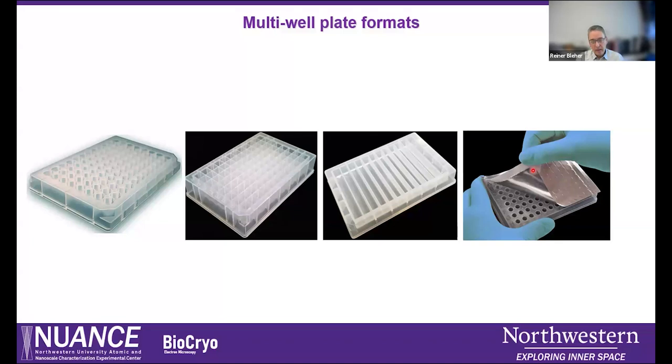And here we can see again what I've mentioned before. We can make those plates in advance and we can seal those plates and store them so they are ready when the day of the experiment comes. Volumes that are required are usually 3 to 4 milliliters per trough here, and about 100 to 200 microliters per well. So it's not too much volume that is actually required.